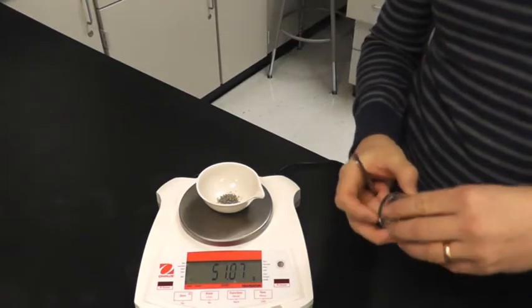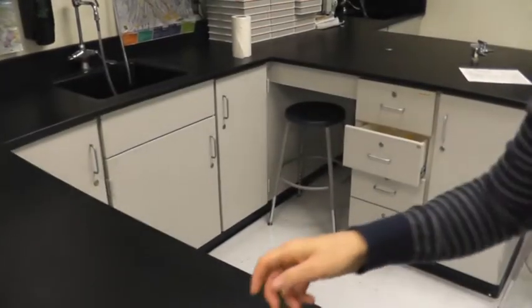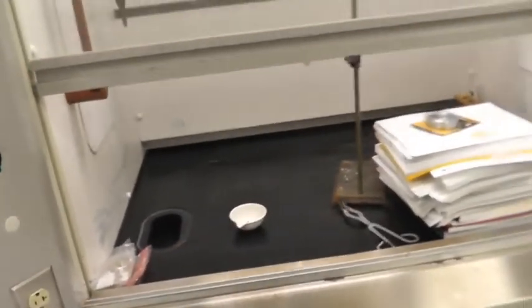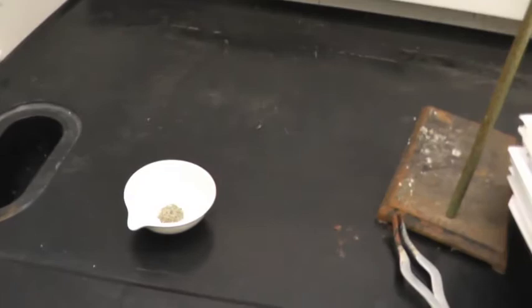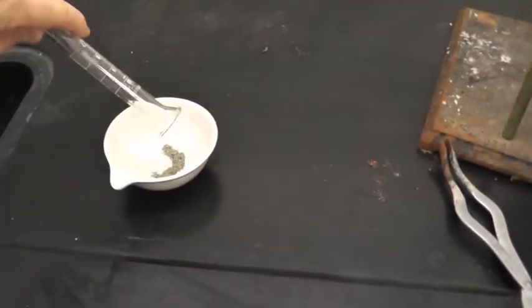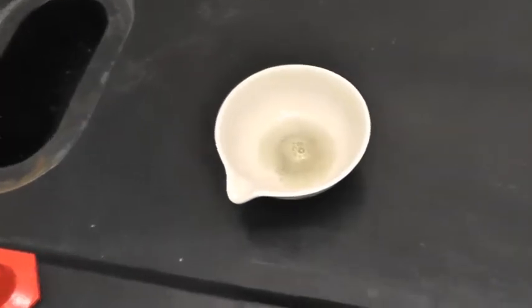So the next thing I'm going to do is I'm going to take this over. Let me see what I can do about changing this angle. So I'm going to bring this over here in the fume hood. This is pretty much the only time we use this all year, because of the gases that we make, which are kind of major components of smog. So I'm going to pour nitric acid onto the tin metal, and you can see it bubbling immediately.